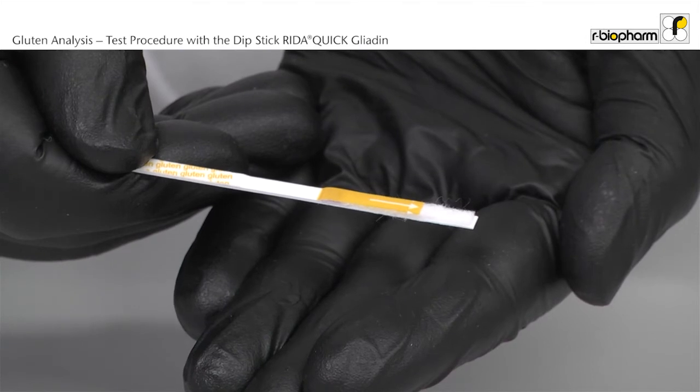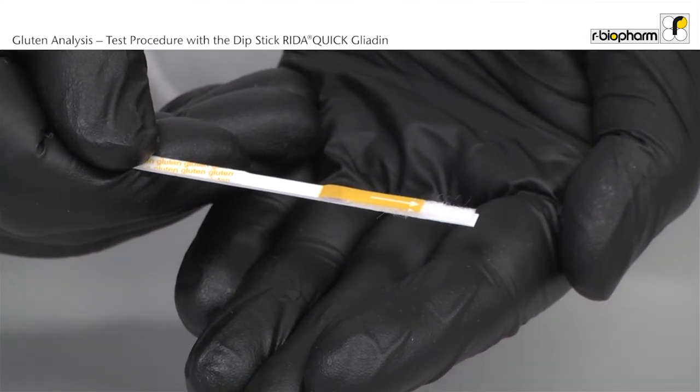Bring all reagents and the dipsticks to room temperature. This takes about 60 minutes before use.